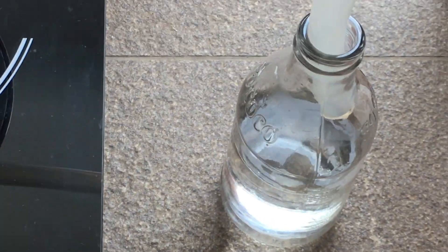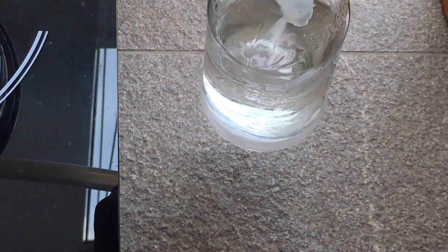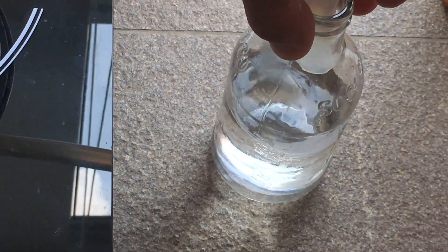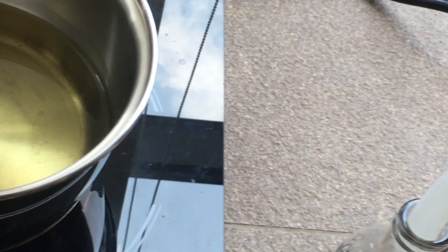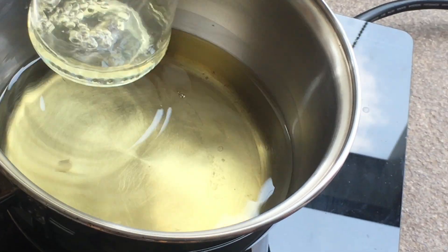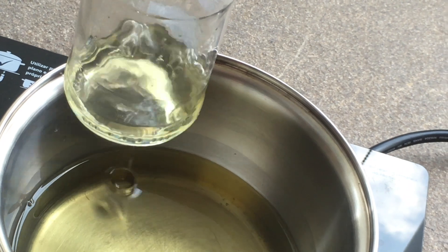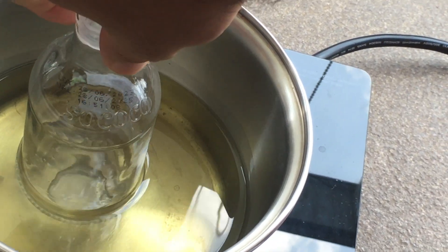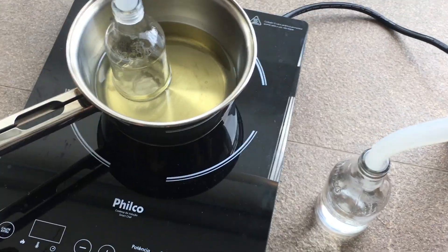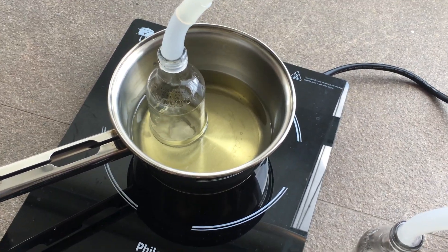Here is the very transparent, clean ethyl acetate — the purity should be quite high. You can see the remaining liquid has an off-yellow color, and that's from the impurities that were in the nail polish remover.